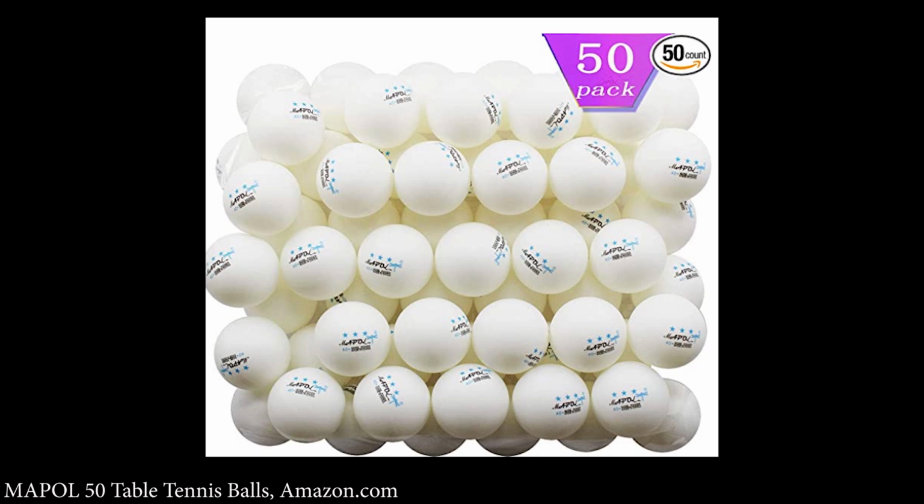So we can think of this as when molecules run into the smaller particles more often, it's a chance for more extractions to occur. And it provides more opportunity on average for molecules traveling through to do more extractions. That averages out better, and that really helps mediate differences in equilibration time. That's that C term in the Van Deemter.